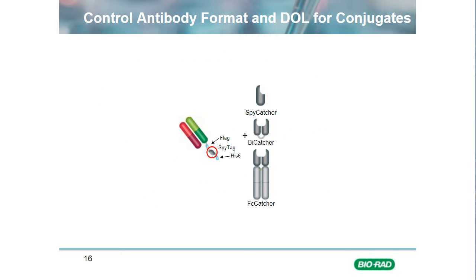Okay, that last slide should set the scene for us to seamlessly segue from our first critical reagent focus point, which is specificity, to our second focus point, which is control of format, because eliminating the possibility of matrix interactions is not the only consideration when planning and selecting the format of the antibody that will become your critical reagent. Choice of format is important.